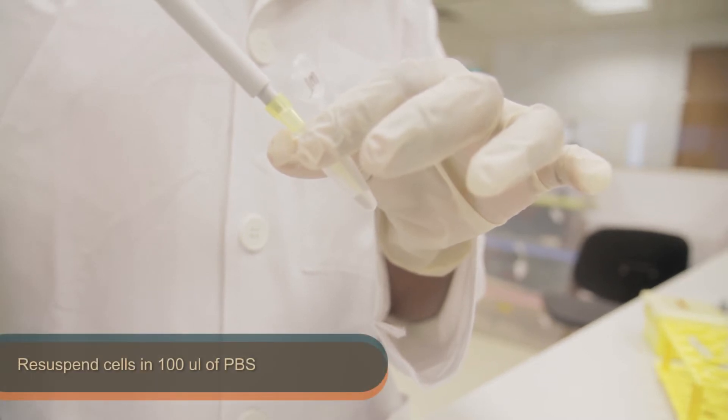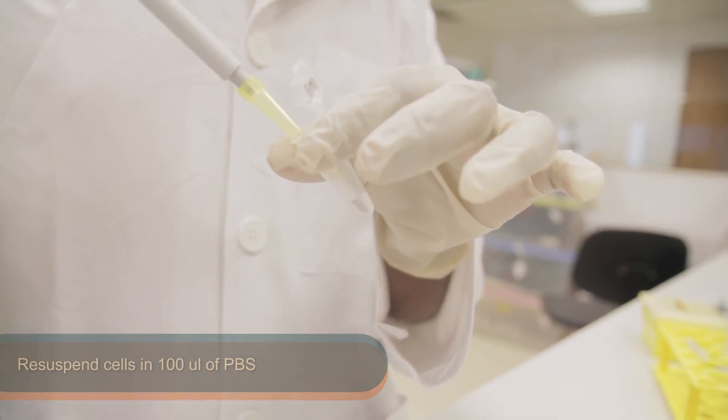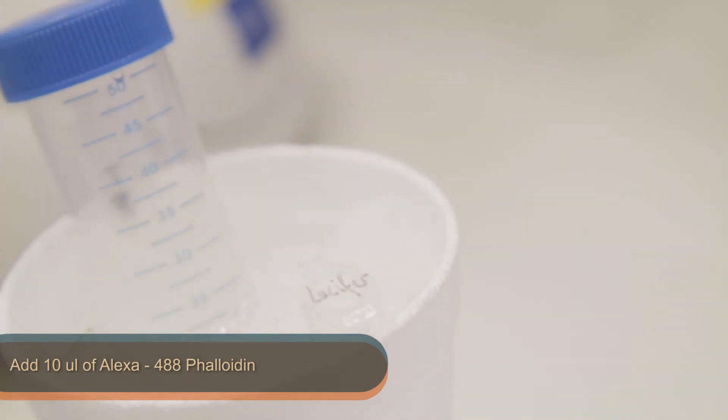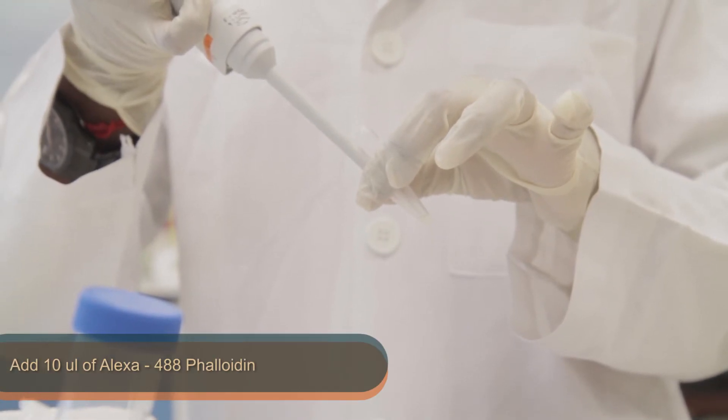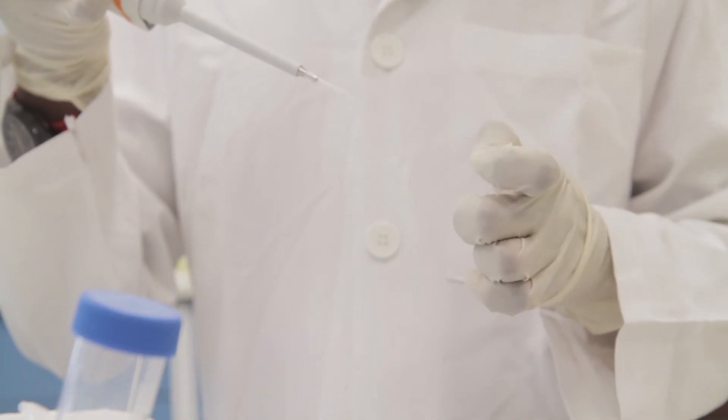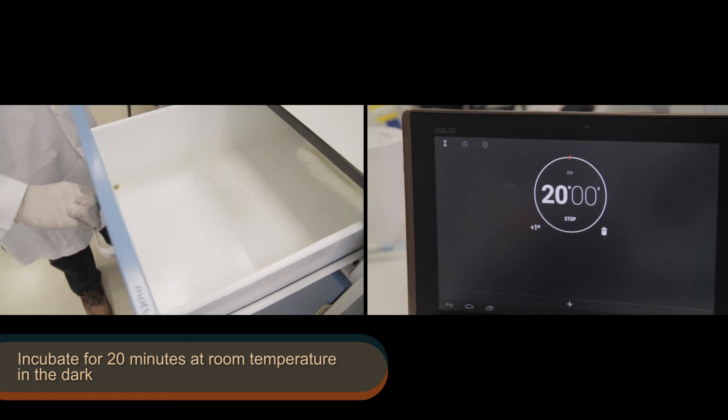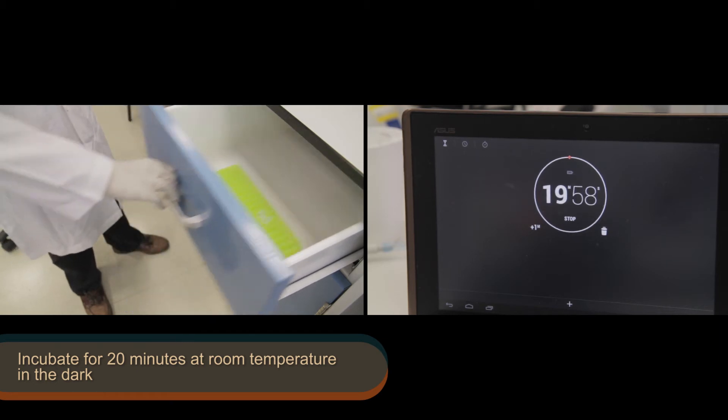Next, re-suspend the cells again in 100 µl PBS and then add 10 µl of Alexa 488 phalloidin. Incubate the samples at room temperature in the dark for 20 minutes.